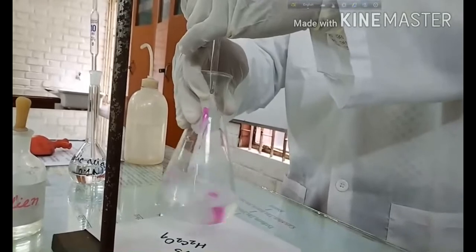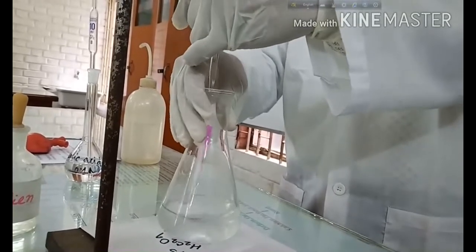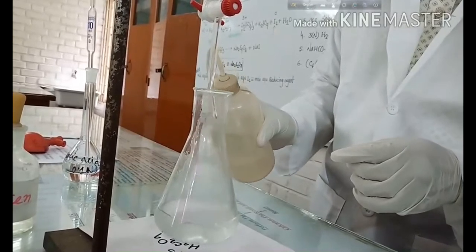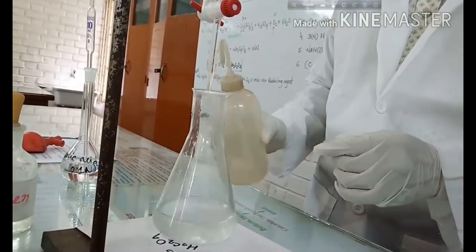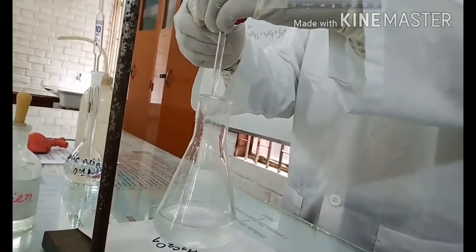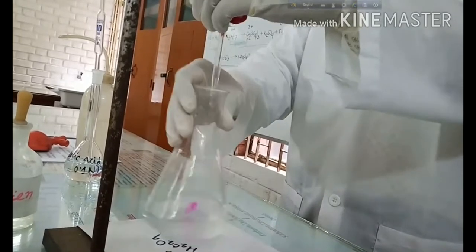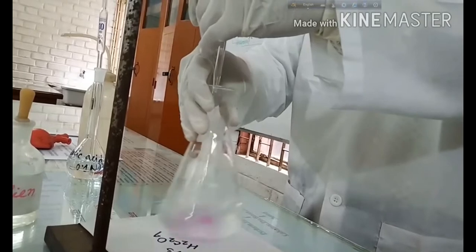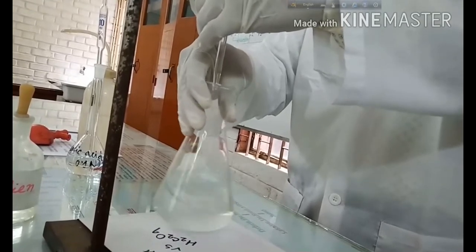And finally, whenever all the H plus ion from the conical flask is neutralized, then we will get the pink color solution, because at that time there is no H plus ion in the solution, only ionized phenolphthalein is present.